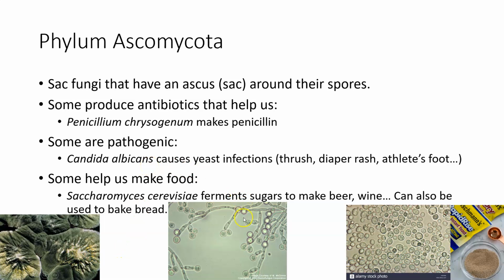Candida albicans. This is one version of it. They gave you a stained version. Mine is unstained. But this one, I don't even know how to describe what I thought. Sort of vaguely cherry blossomish is how I've always kind of thought Candida albicans looks. I've heard some people say like fireworks, which I don't see, but if you see fireworks when you look at this one, awesome. Candida albicans is the species that causes yeast infections in people.